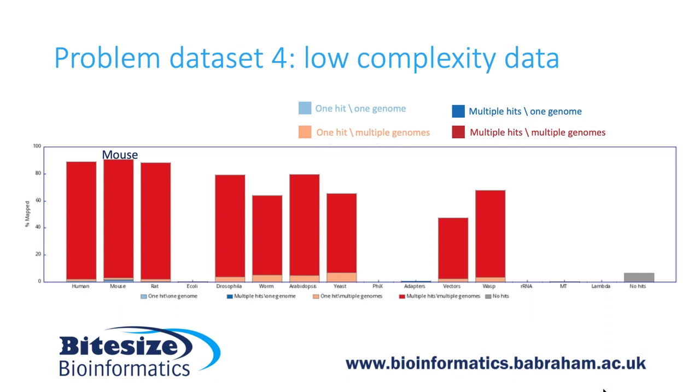But this underlies the importance of valid QC, for if I didn't perform QC on this dataset and just double check everything was looking as it should, I may just naively assume that around about a 90% mapping efficiency had been achieved and this was a good sample. Whereas in reality, what we seem to have done is sequence some low complexity molecular artifact.